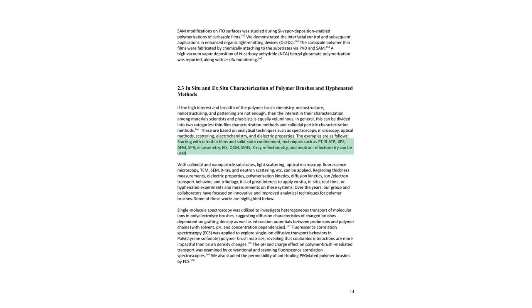Ellipsometry can measure the thickness and refractive index of the brush layer. Quartz crystal microbalance, or QCM, can measure the mass of the grafted layer, including any solvent that it absorbs, giving insight into swelling behavior. Atomic force microscopy, or AFM, can probe the topography and mechanical properties of the surface.